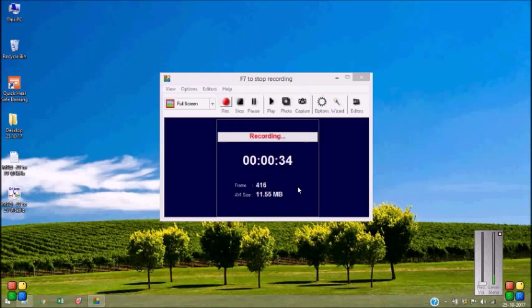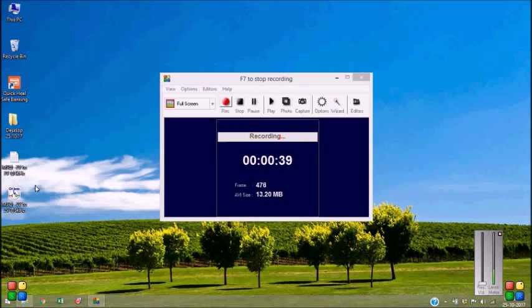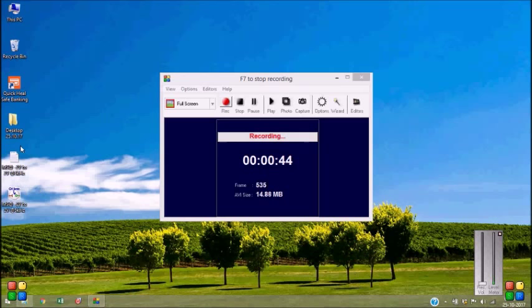First of all, for my convenience, I have placed the raw data, the bin file and the ASCII file obtained from a Mott-Schottky measurement using the CH instruments.